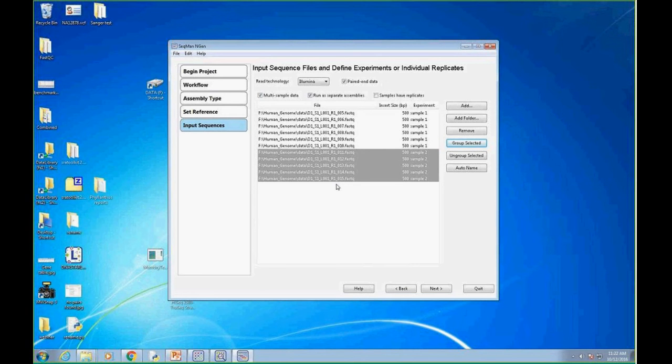So you can set up all your assemblies here in this interface. And if we have a control, we can set a control. And this is the page that has some of the combining. So again, back to the combined idea that we have these combined workflows. You can see now I can do a variant detection mode. I can say this is a diploid, and I can say calculate copy number variation. So for the targeted resequencing and for the whole genome, we can now have both types of analyses together at the end.